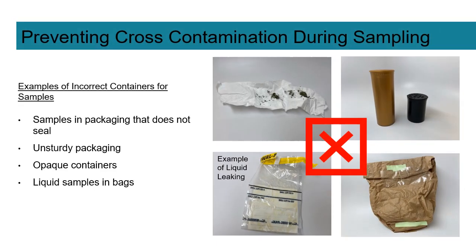Examples of incorrect containers for samples. Samples in packaging that does not seal, unsturdy packaging, opaque containers, liquid samples in bags.